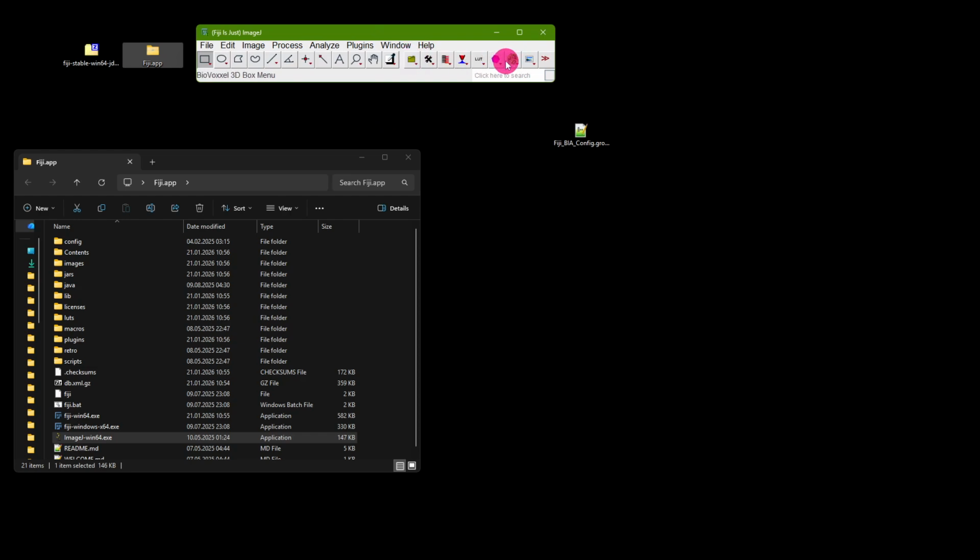This should automatically happen. Careful, if you do not see these icons, or the starting icon doesn't change, then something in the updating process went wrong. This can happen if you are, for example, in an institution that blocks Fiji from running this update properly, but then you should normally also see an error message during the updating process. It can also happen if you're behind a strict firewall or if you're using a VPN client. So it might be that in your institution it potentially doesn't work.